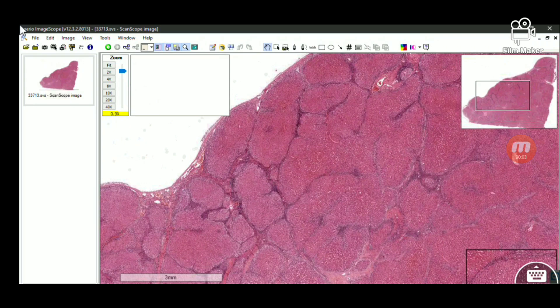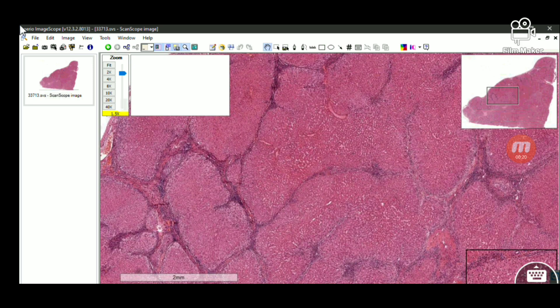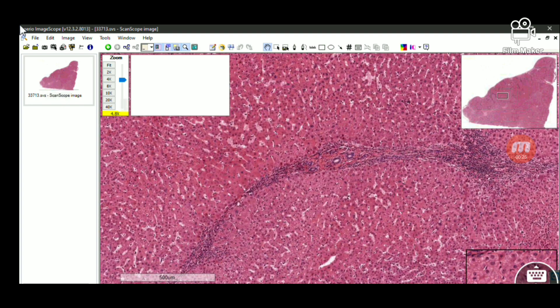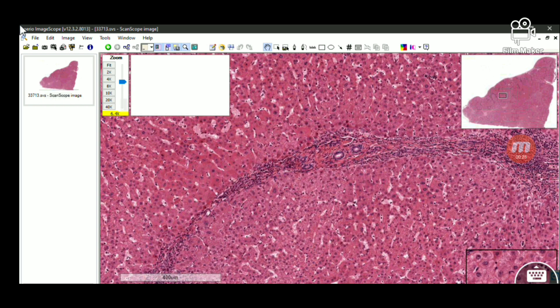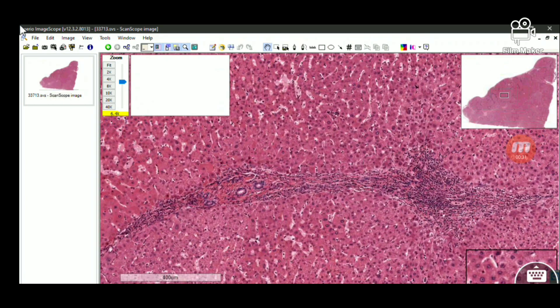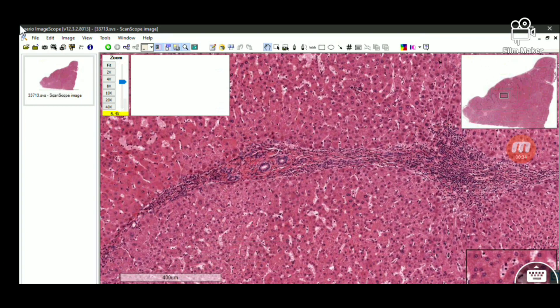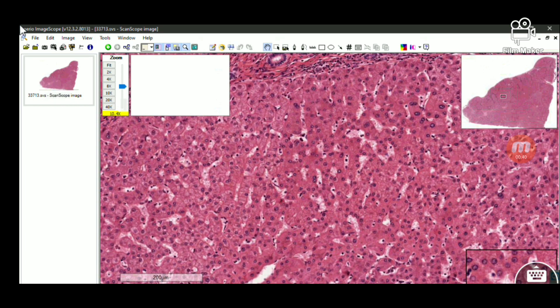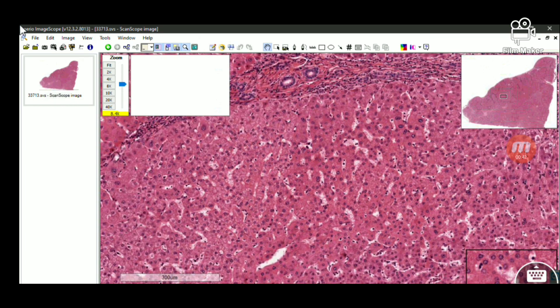Now let's look at the slide of cirrhosis. Cirrhosis is basically replacement of normal liver architecture by regenerative nodules of hepatocytes. We call them regenerative because this occurs due to repeated injury and repair. There is complete effacement of liver architecture — no cord-like arrangement of hepatocytes and no sinusoidal arrangement. The hepatocytes are arranged in nodules.